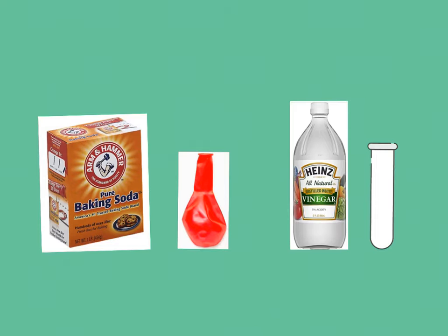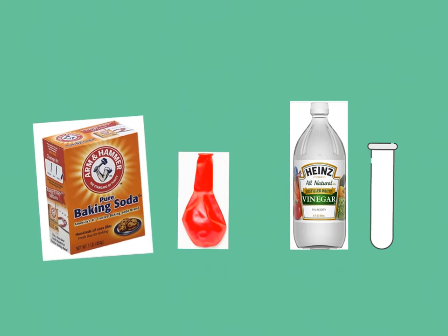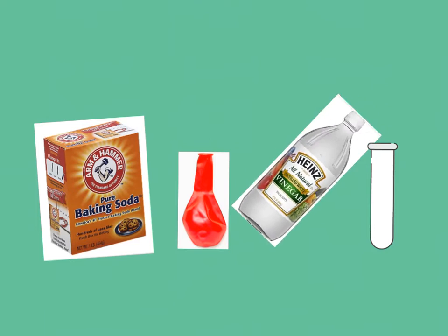To carry out this reaction, we are going to add baking soda to the balloon and vinegar to the test tube.